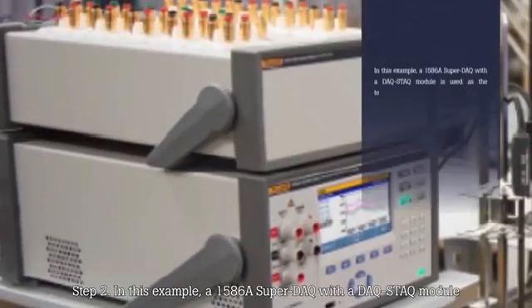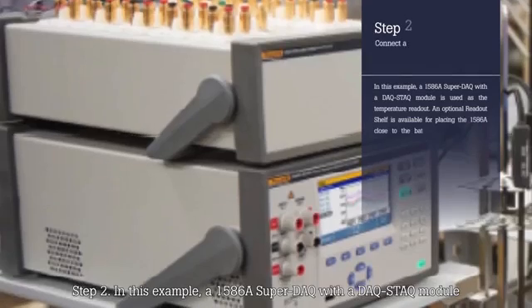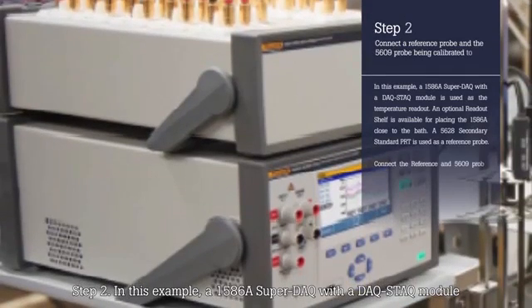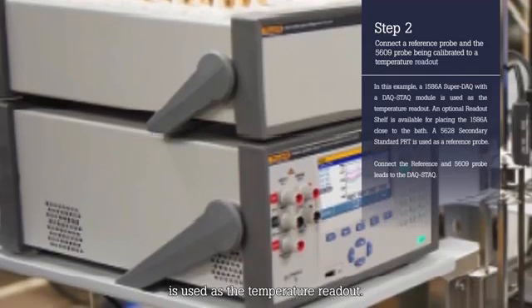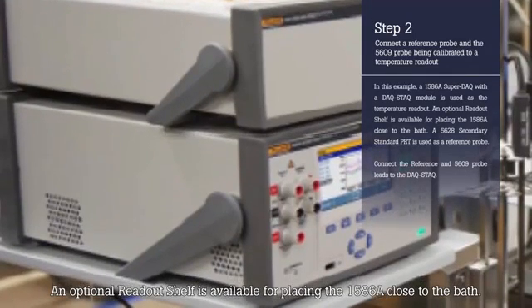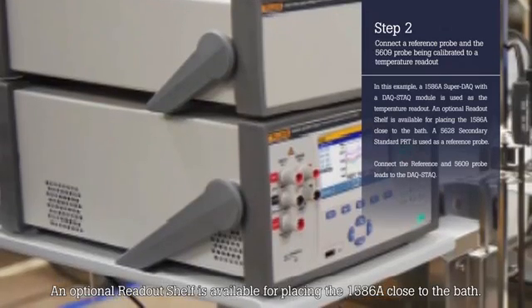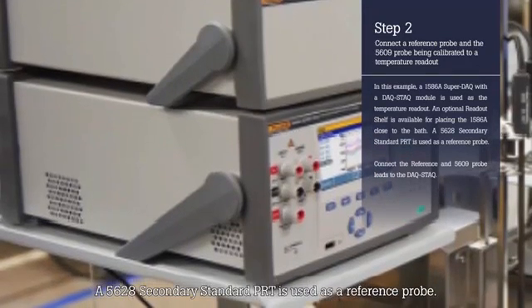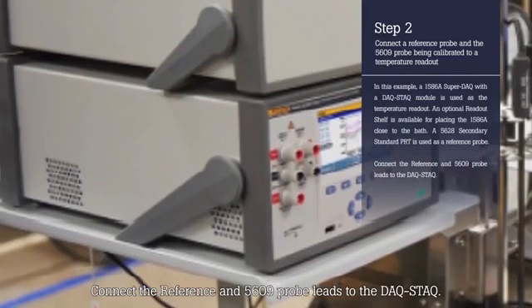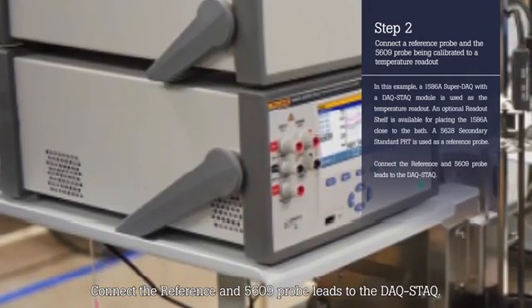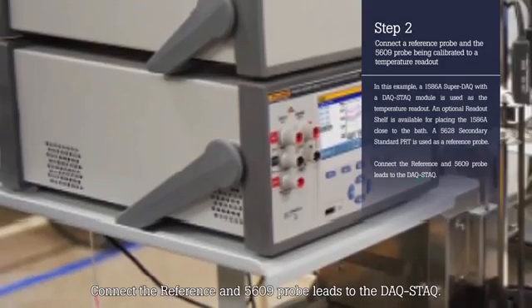Step 2: In this example, a 1586 Super DAC with a DAC-Stack module is used as the temperature readout. An optional readout shelf is available for placing the 1586 close to the bath. A 5628 secondary standard PRT is used as a reference probe. Connect the reference and 5609 probe leads to the DAC-Stack.